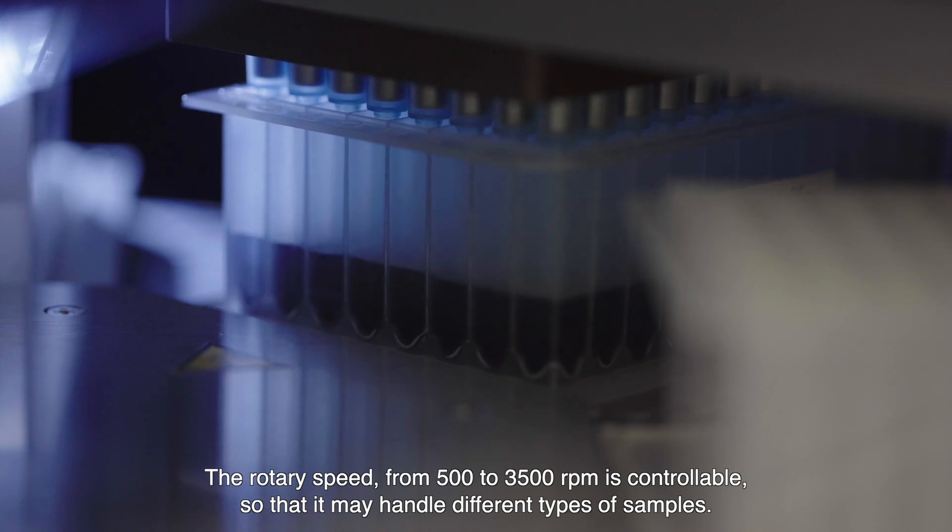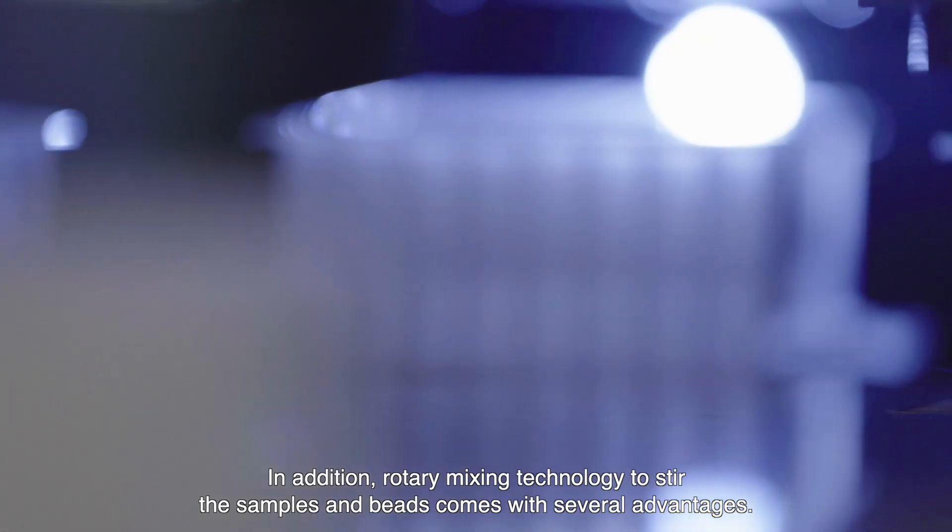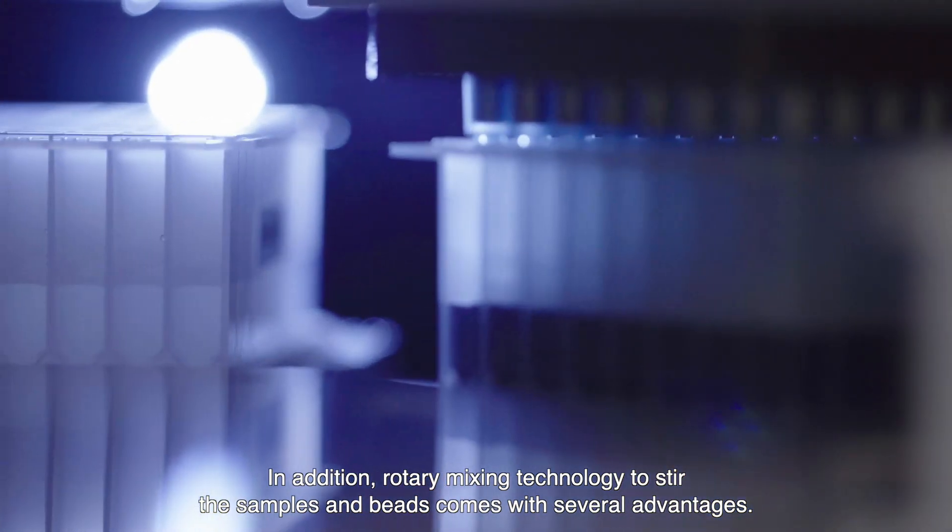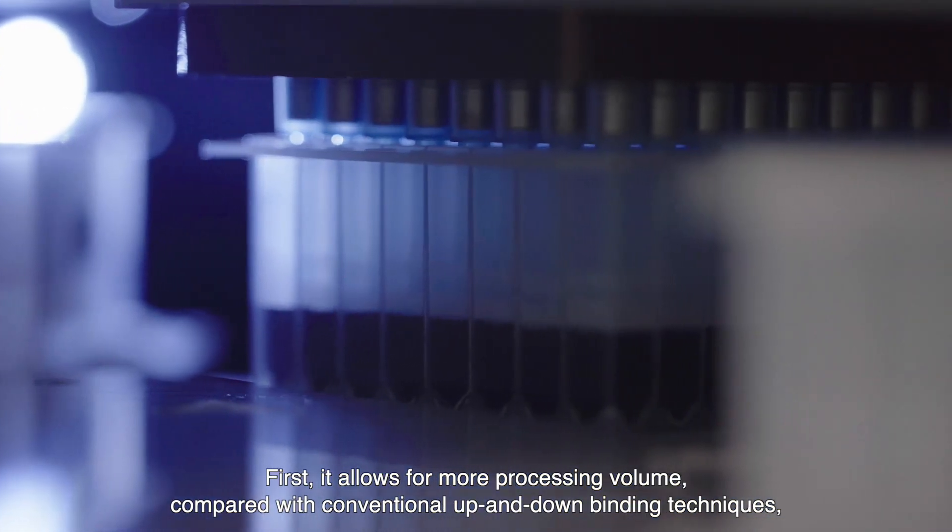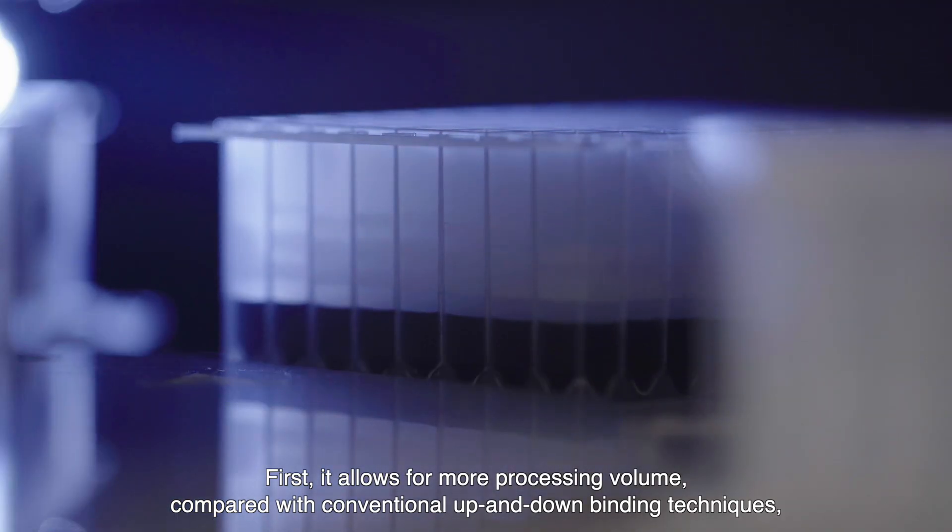It stirs the specimen with beads and buffer by a rotary apparatus driven by the motor. The rotary speed from 500 to 3500 RPM is controllable so that it may handle different types of samples. In addition, rotary mixing technology to stir the samples and beads comes with several advantages.